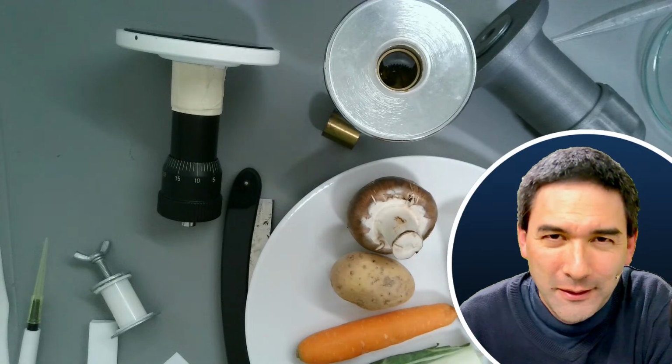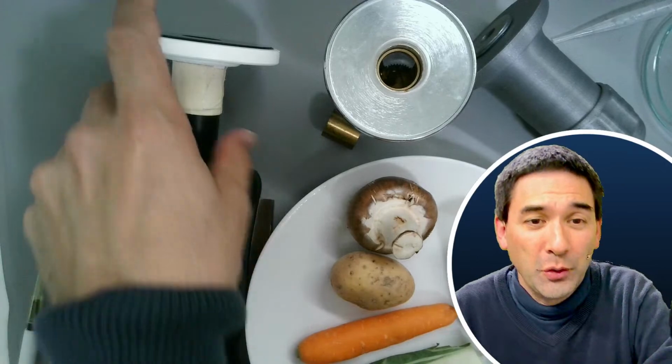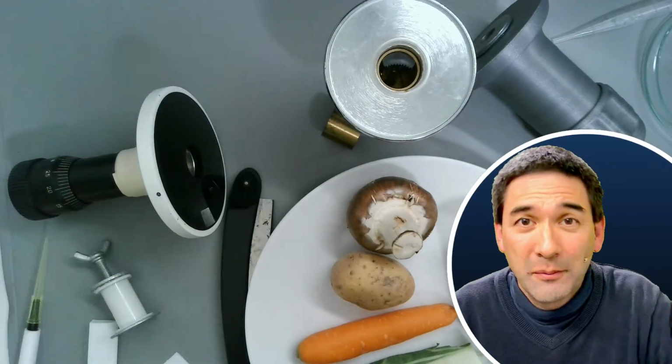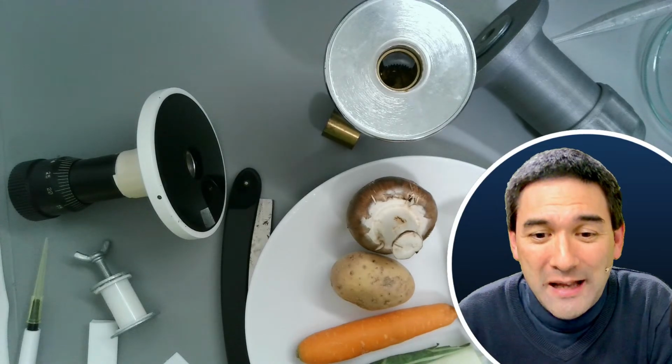MicrobHunter here. Today I would like to show you a couple of my hand microtomes that I have, and I'd like to discuss a little bit some of the advantages and disadvantages that some of those microtome models have.